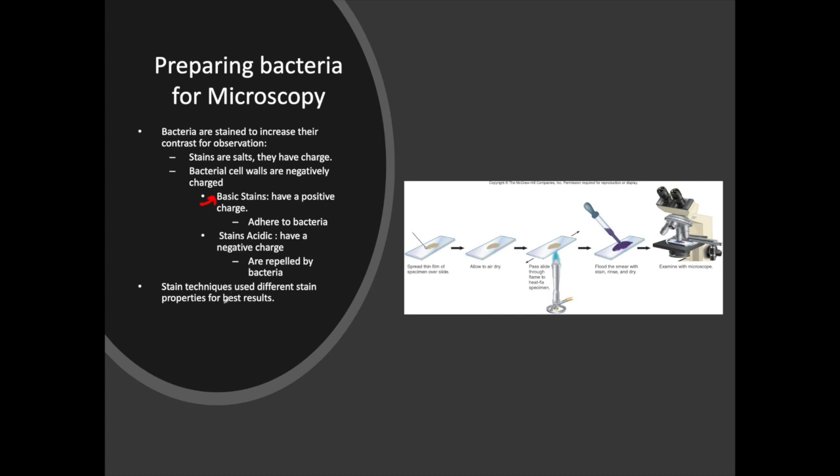That's known as a negative stain, and that type of staining method uses a stain that we call acidic dyes. With acidic dyes, the bacteria are going to repel the stain, and we don't rinse it, so that the background of the slide is nice and dark, and the cells are not stained at all, and light will shine through the cells. So negative staining and using acidic dyes will mimic Darkfield microscopy.